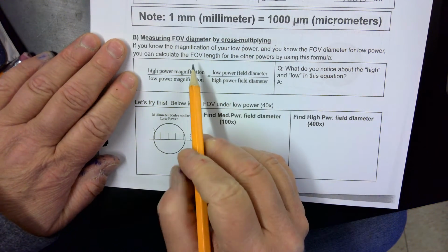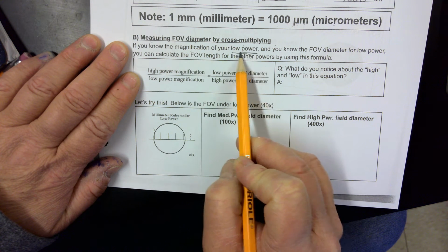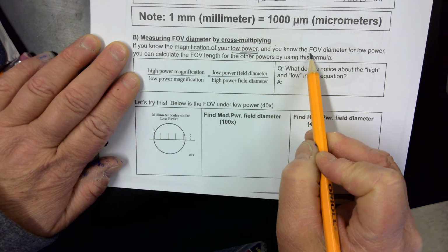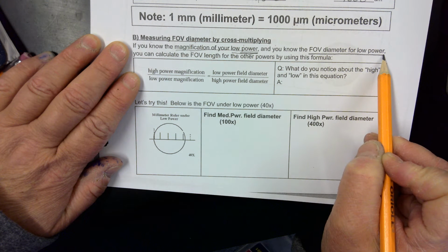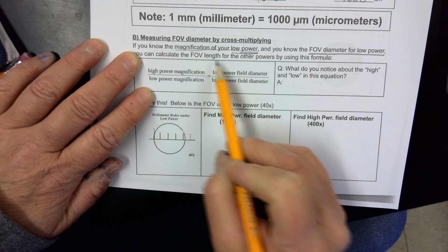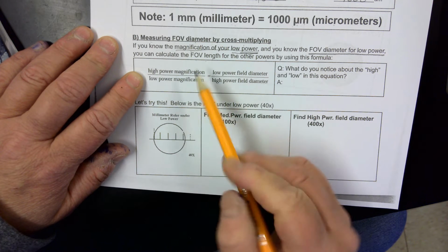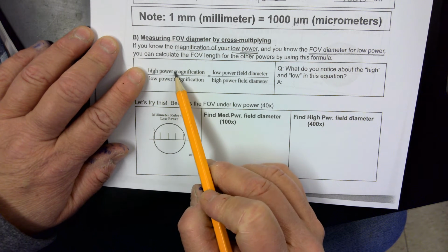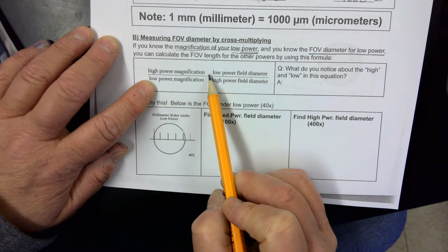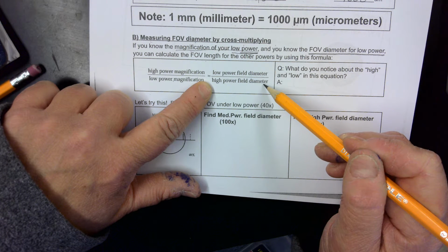It's a ratio. If you know the magnification of your low power, and you know the field of view diameter for your low power, you can calculate the field of view diameter for any of the other powers using this formula. What we see here is the high power magnification divided by the low power magnification equal to the low power field diameter over the high power field diameter.